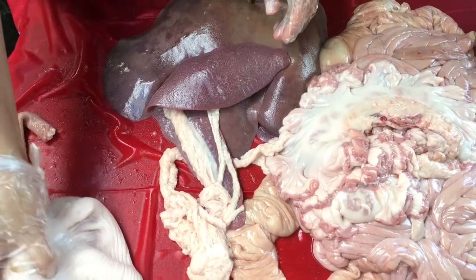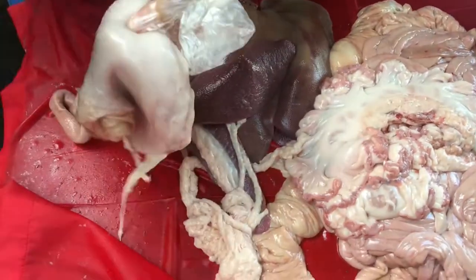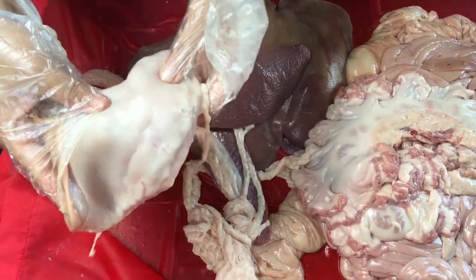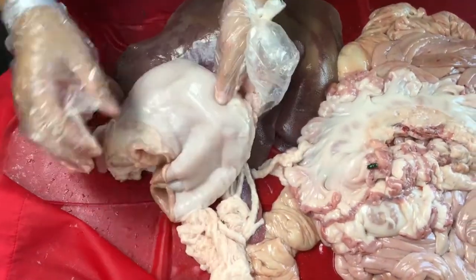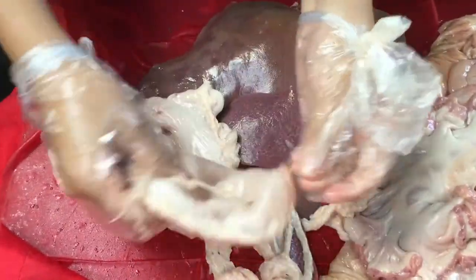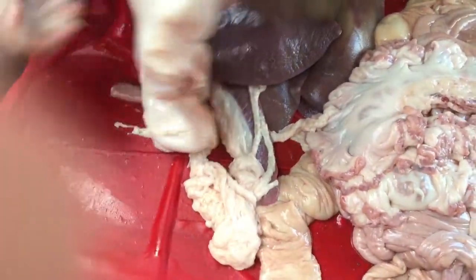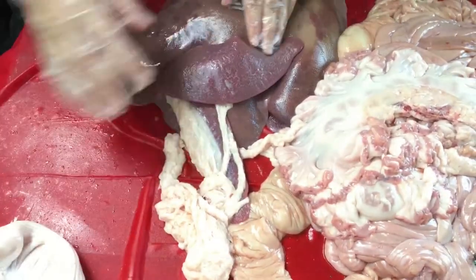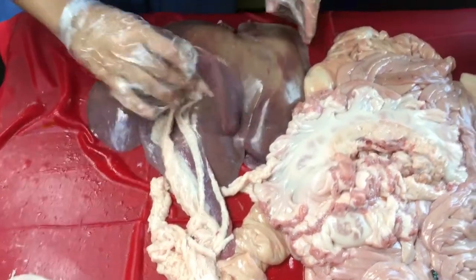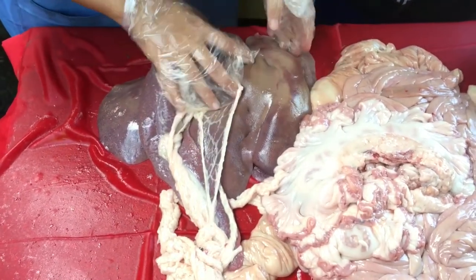So the stomach has already been separated from the small intestine. The stomach has hydrochloric acid and pepsin together. Those begin the breakdown of protein that's in there. There was stool in here a while ago, but the butcher has already cleaned it. I cannot show you the stool, but we all know what stool looks like. The food will move from the stomach down to the small intestine. So we will now go to the intestine, the small intestine.